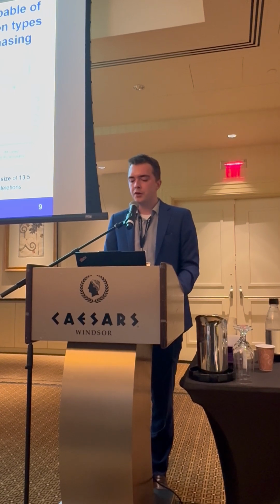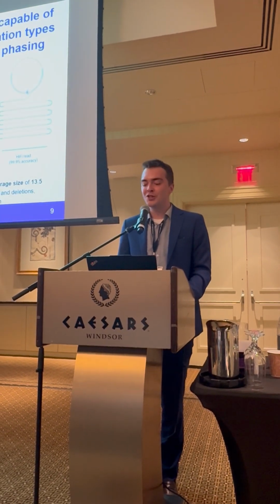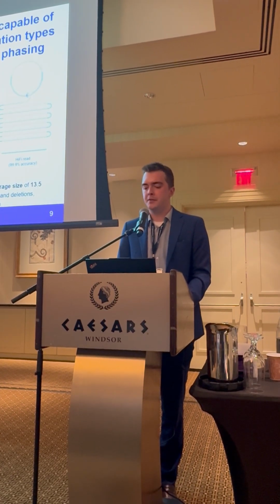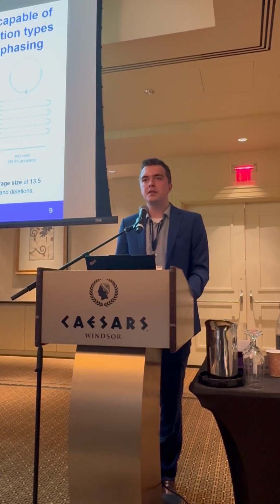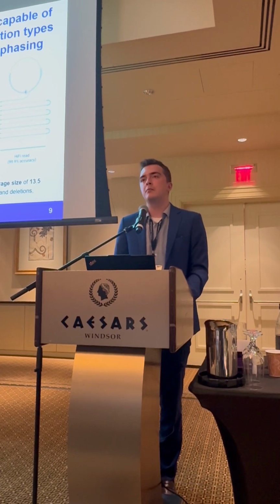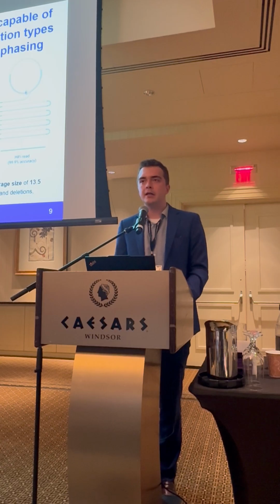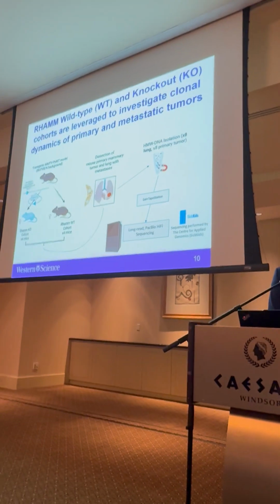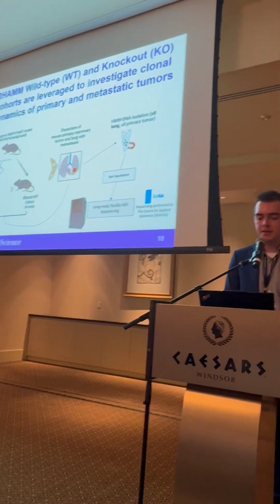This technology essentially works by using a high molecular weight DNA input, which are really large fragments of DNA that become circularized by adding SMRTbell adapters. After being circularized, we combine primers, and then DNA polymerase sequences the same molecule by going around the circle over and over again, reading both the top and bottom strand within one read until a high-fidelity, or HiFi, consensus read is generated.